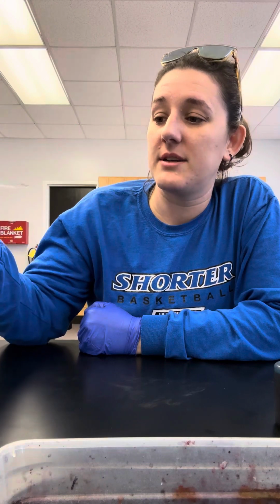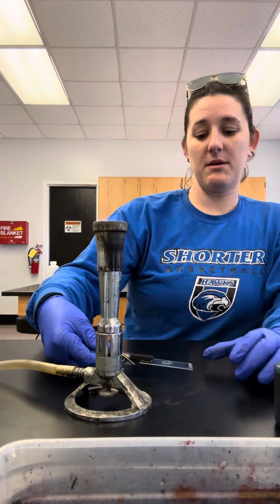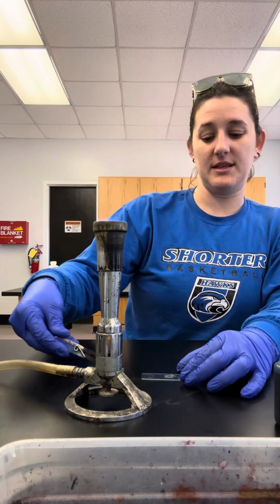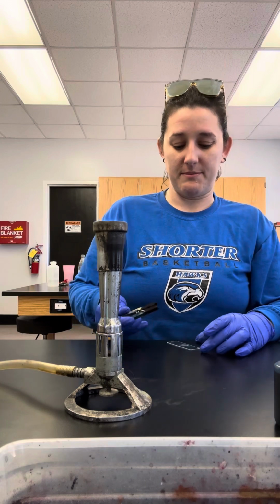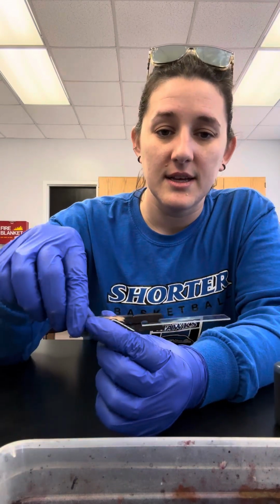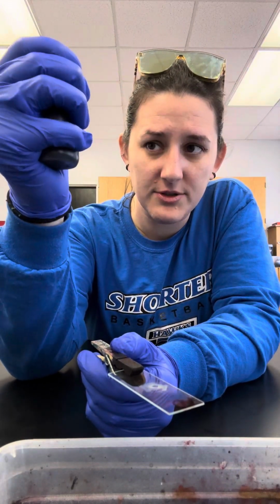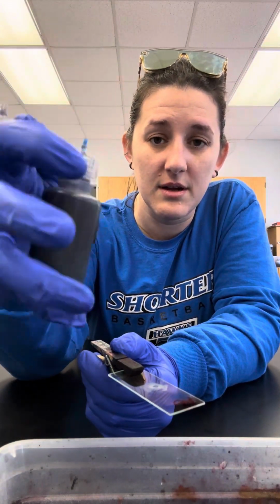Okay, so now here's what I do. I take this, pass it over 1, 2, 3. All right, I don't want to do any more, but y'all know how to heat fix at this point. I don't know why I took that off the clip. Okay, so now I've heat fixed. Done with the gas. Put it up. All right. So now I'm going to put the 2 to 3 drops of methylene blue on this, and I am going to let it sit.